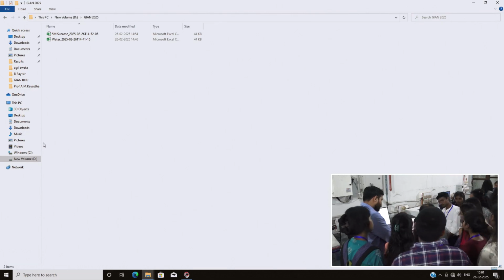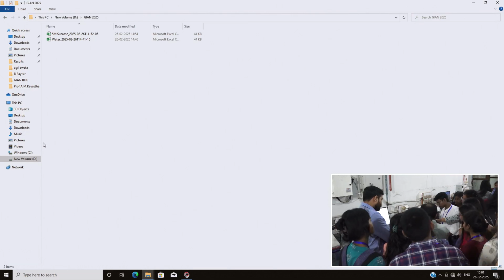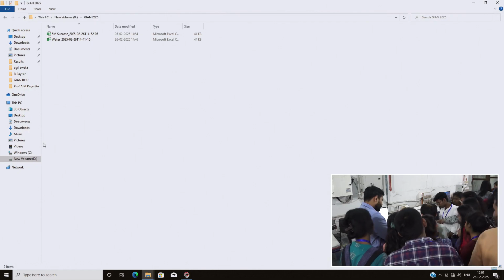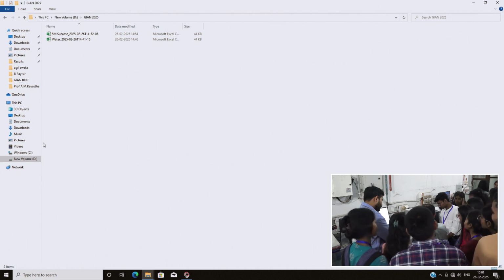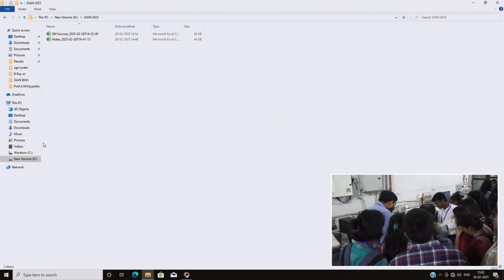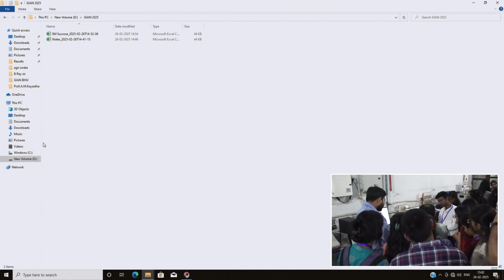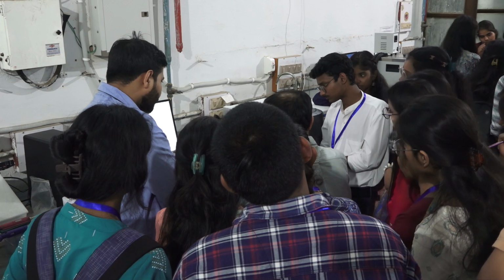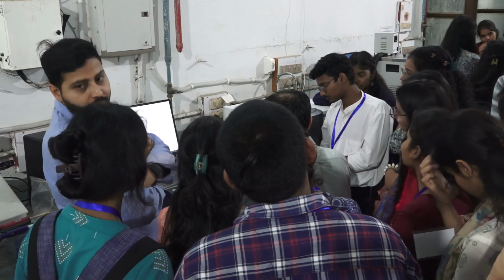Okay, this peak is 1014. Let's identify the peak position.